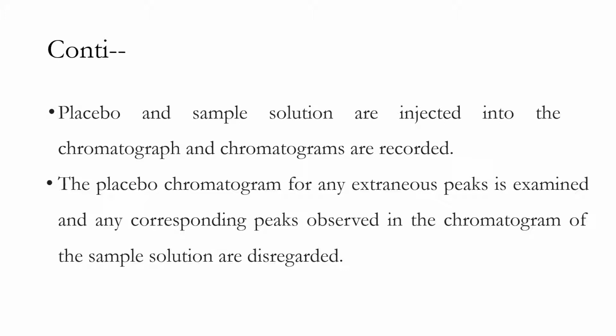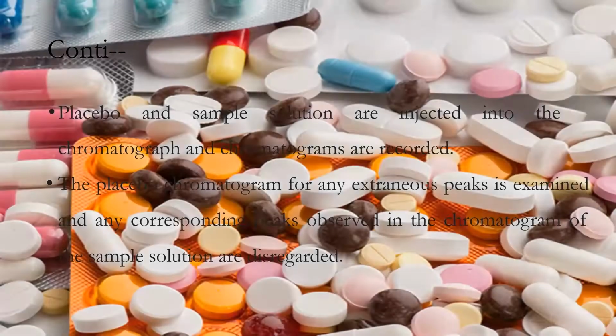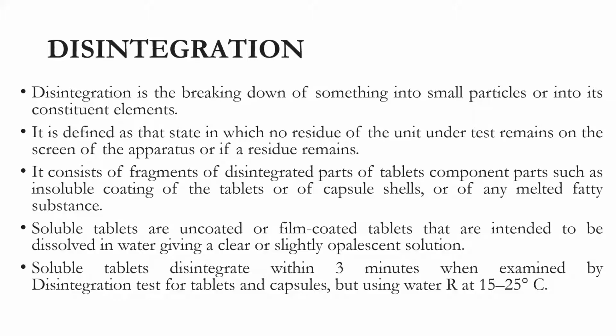The placebo chromatogram should be examined for any extra peaks and compared with the corresponding peak, and then you can reach some inferences or predictions about whether this can be degraded or not.